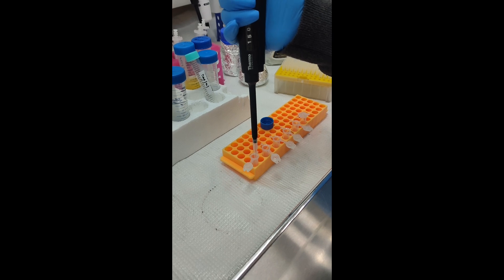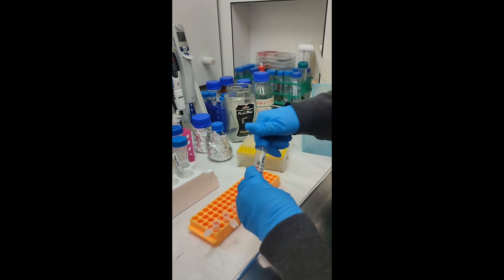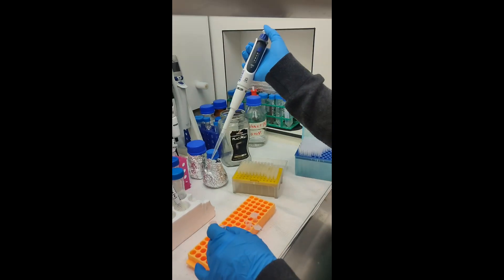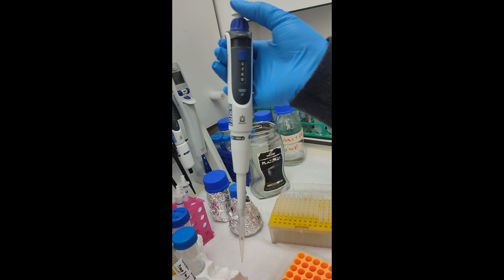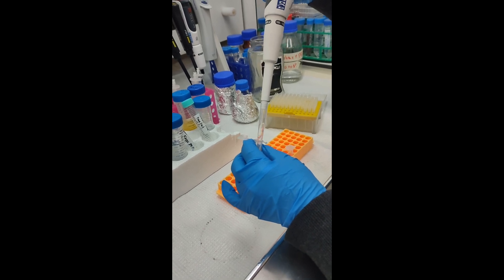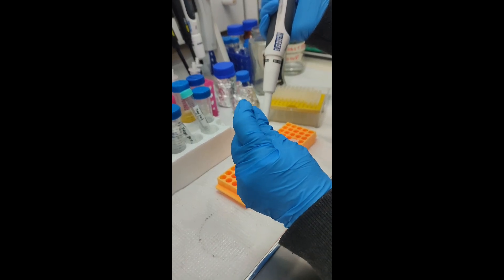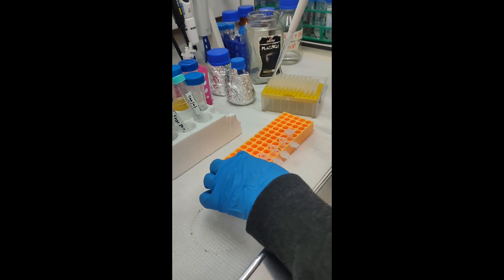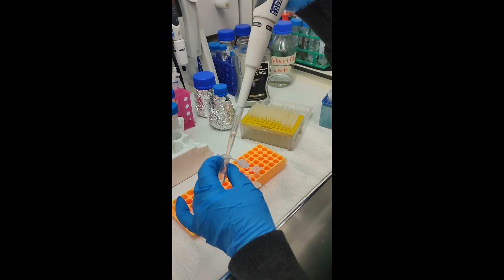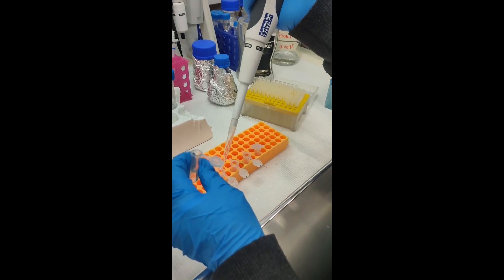To the first tube. It's at 750 microliters — she's taking from the first tube 750 microliters. She is pipetting three times to mix it, then putting it into the second tube and pipetting that three times, then moving to the third tube.